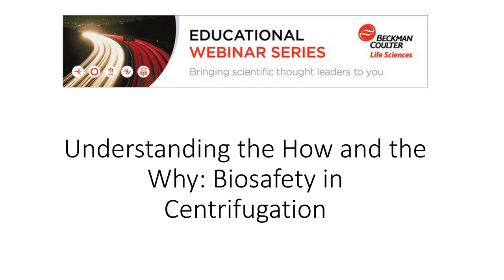Just keep them clean. Yeah, and I'll add to that about the laboratory environment. If you've got the sort of rotor where it would really help to have a flashlight to be able to see if you've got some white salt deposits at the bottom, then it would be really nice to have that flashlight handy. Correct.